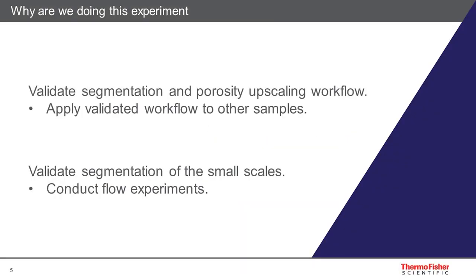So, what do we hope to achieve with this experiment? First, we want to validate the segmentation and porosity upscaling workflow. With this workflow validated, we can then apply it to other samples. Second, we want to validate the segmentation of the small scales in order to conduct flow experiments.